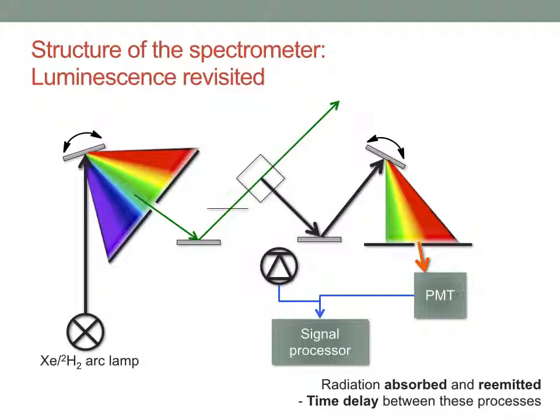Here I have a source of a xenon deuterium arc lamp. This is a perfectly acceptable option, and then using a monochromator to select a single wavelength. But again, nowadays we tend to use a laser when we do Raman, but the fact that I'm showing you a fluorimeter means that we can actually get some basic Raman measurements out of a fluorimeter.